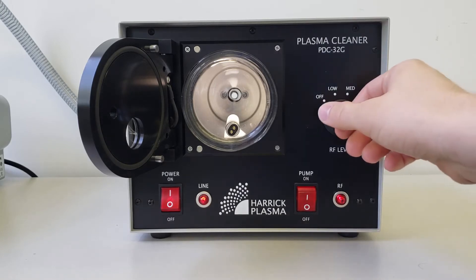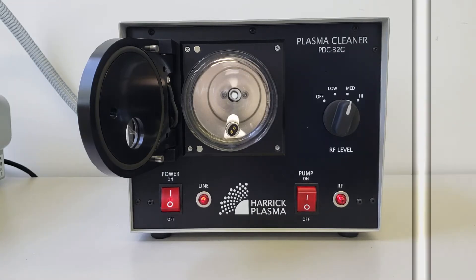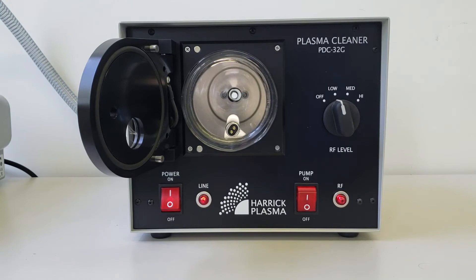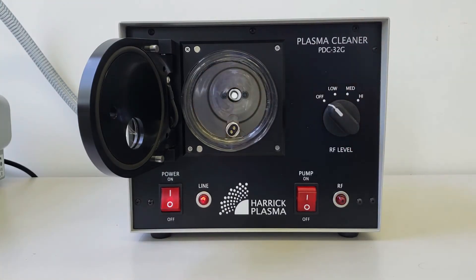If the bulb lights up, turn RF power to medium. The bulb might take another 10 seconds to warm up. When the bulb lights up, turn the power to low. Additionally, you may need to move the bulb around in the chamber to get the bulb to light at lower power settings.